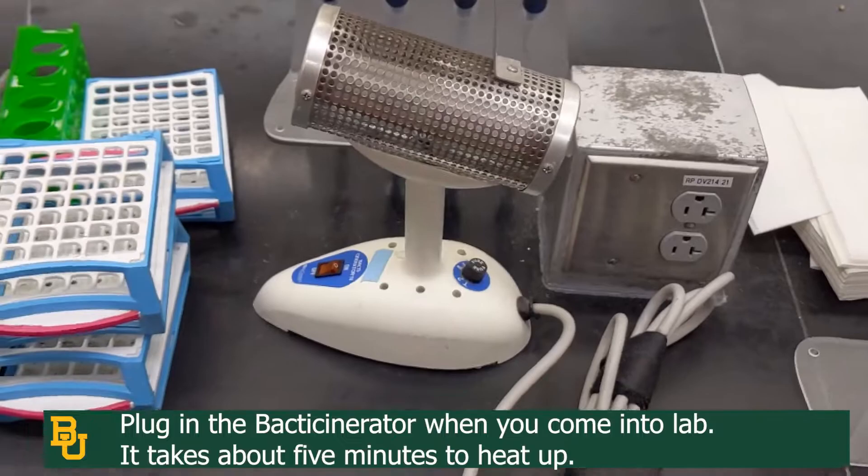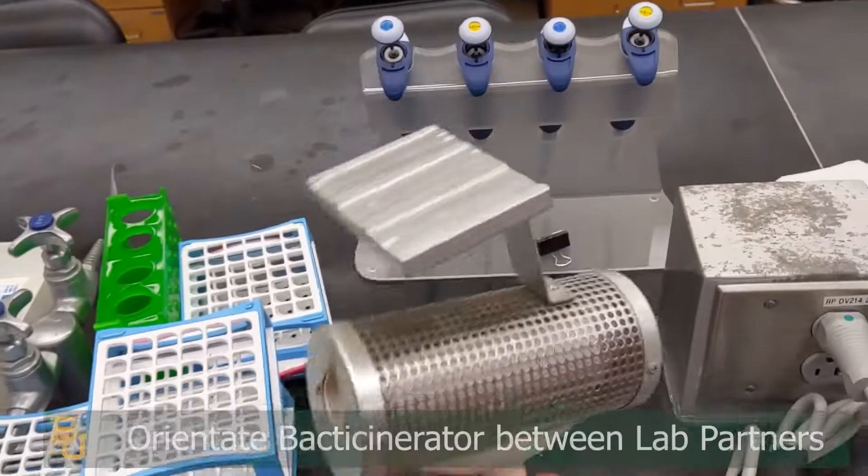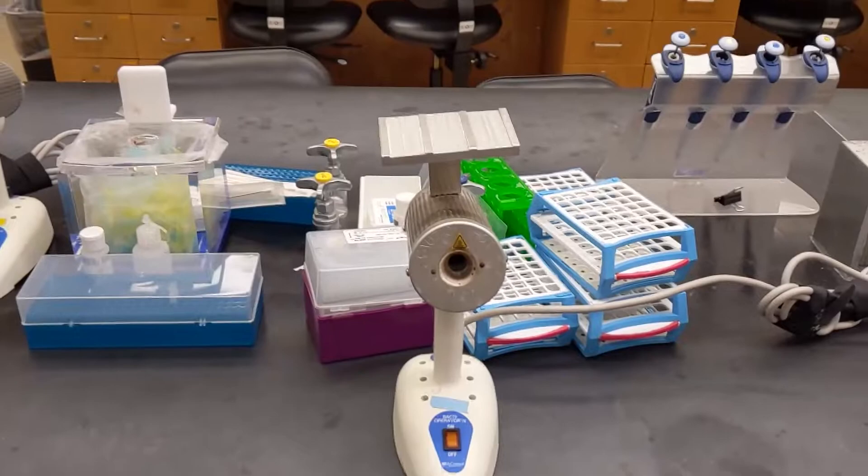To start using the back decinerator, always make sure to orient it properly so that it's usable by both parties at the table, and then plug it in. Once plugged in, you can leave it in the center, like so, or you can move it between you and your other lab partner.